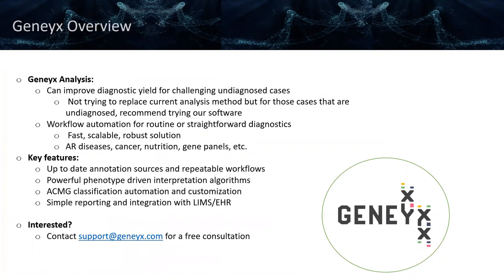So to provide an overview of what I demonstrated today, the Geneyx Analysis platform can improve your diagnostic yield for challenging undiagnosed cases. So again, maybe for the clinical geneticist or expert in the field, we're not trying to replace your current analysis method, but if you have some cases that are being relatively challenging with your own bioinformatic pipeline, we might recommend you try our software.